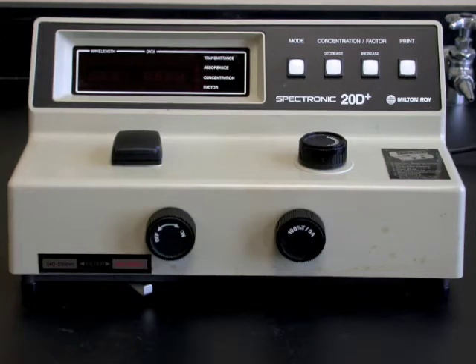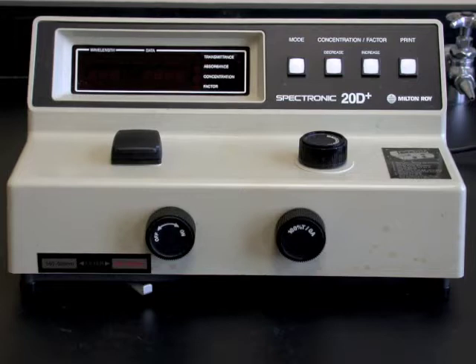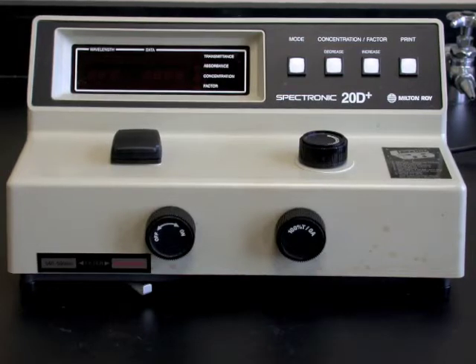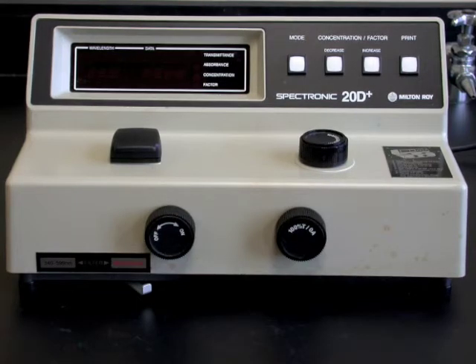This video covers the basic operating procedure for a simple photometric instrument called the Spectronic 20. The instrument allows one to record absorbance values for solutions in the visible range, approximately 350 to 800 nanometers.